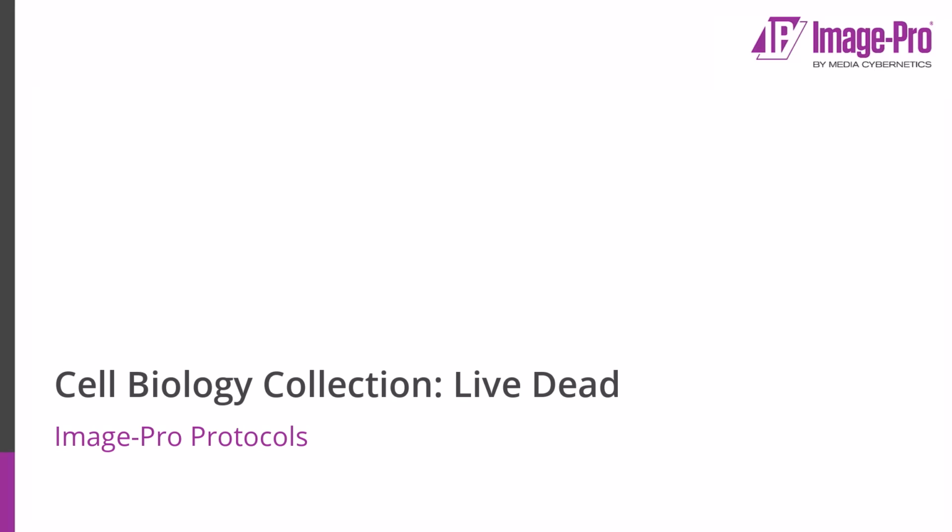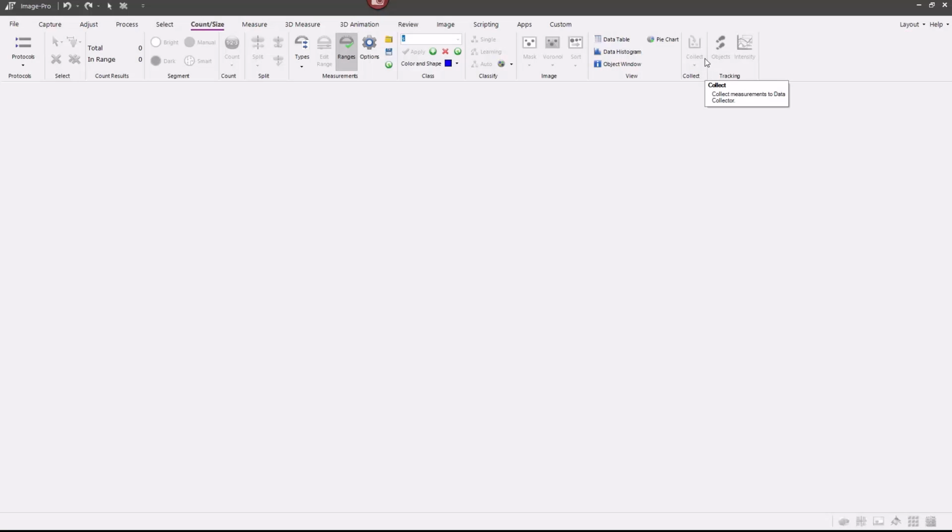In this short video, I'm going to discuss the live dead cell analysis protocols, which are part of the cell biology protocol collection. The protocols are designed to measure the population of live versus dead cells. There are 4 live dead cell protocols based upon the fluorescent marker inputs available.